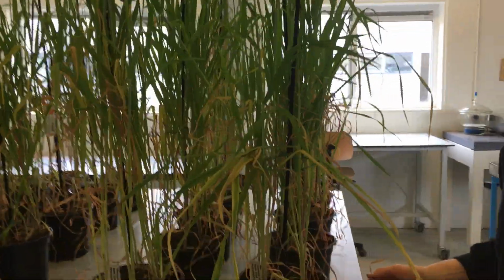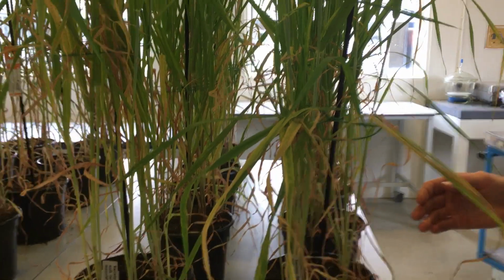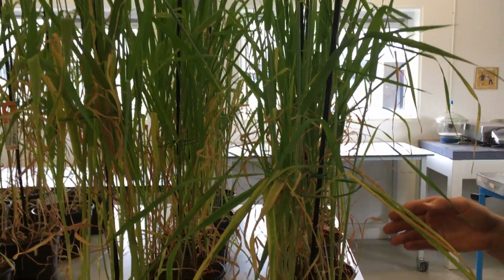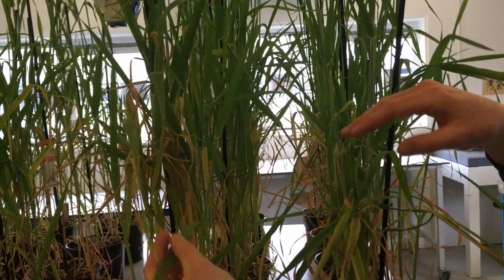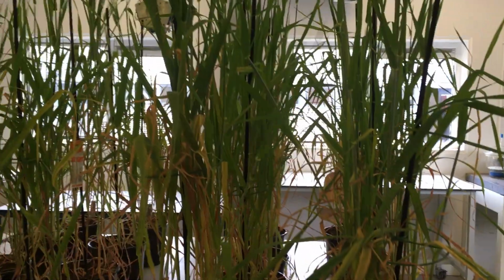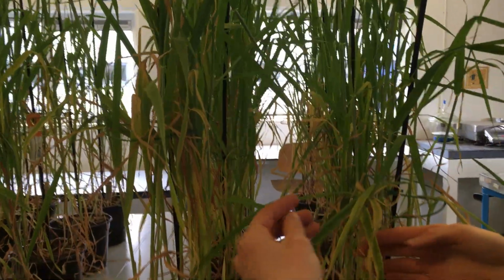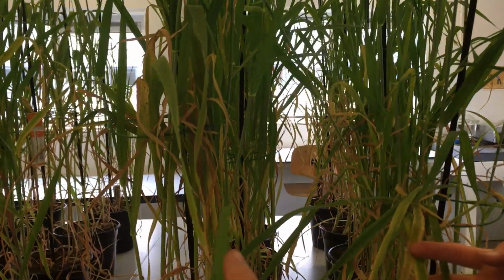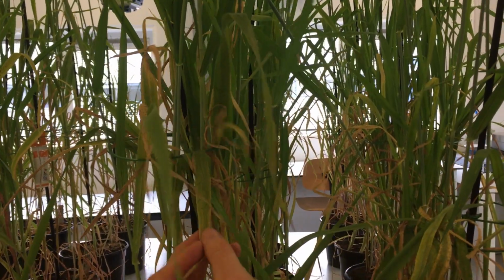If I look at the first 2 pots, they are the same cultivar. One is non-inoculated. Could you point to the non-inoculated one? This one. This is non-inoculated. And also this is the inoculated one. But I do see also the non-inoculated one has yellow necrotic spots on it. What's that? Yeah, that's right.